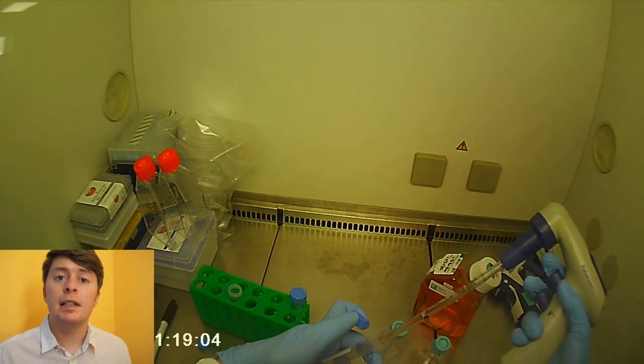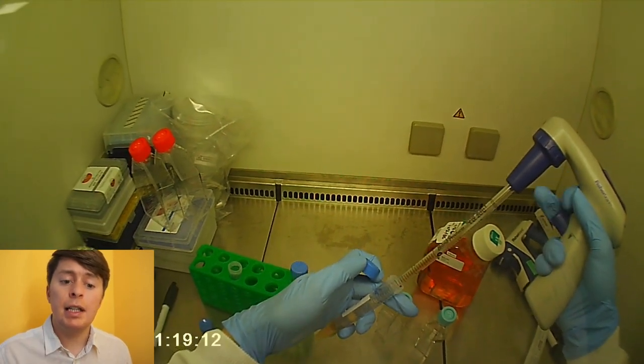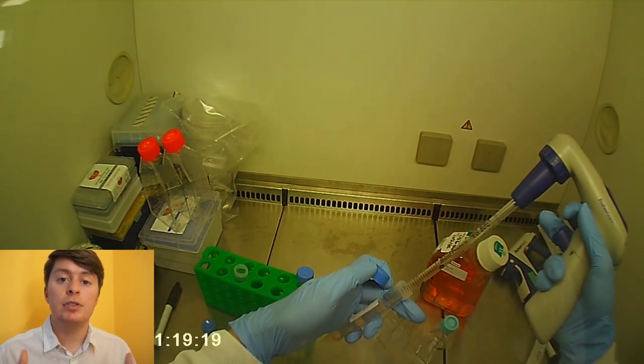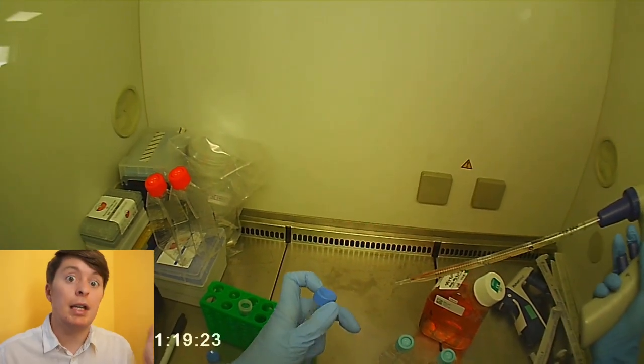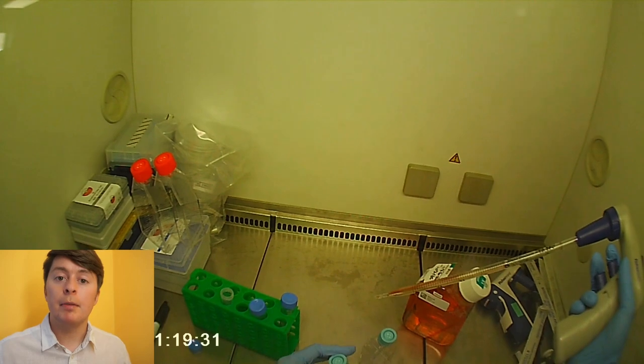So you'll also notice in this scene that I'm using an automatic stripette and I do a motion with my fingers up and down. And as you can see with the liquid inside the stripette, that is going up and down. And that's simply so that we resuspend that pellet and break it up a little bit, because the pellet is just a bunch of cells stuck together in a clump. And we need to mix the media across it so that we can gently break up that pellet so that it's distributed homogeneously throughout that solution. And it's not just got one large clump, because otherwise we'll most likely get a necrotic core and lose a lot of our cells. And this is very important to consider when we are working with cells that have just been thawed, because again, we need to get rid of all of that DMSO in the most efficient way possible. So by breaking up that pellet, we don't end up with cells that possibly won't get exposed to that media and get washed.